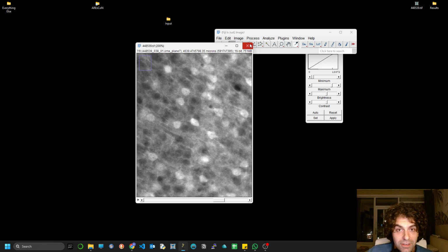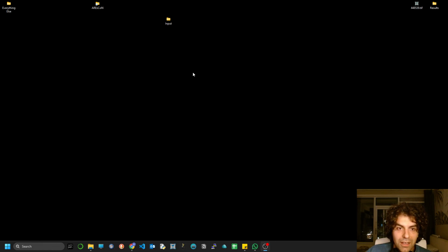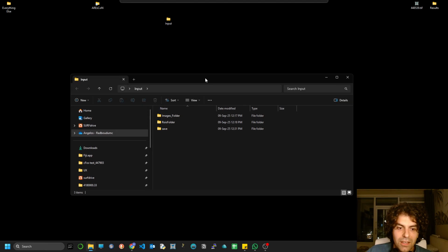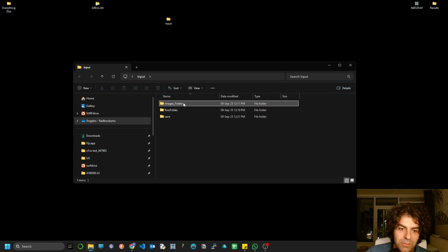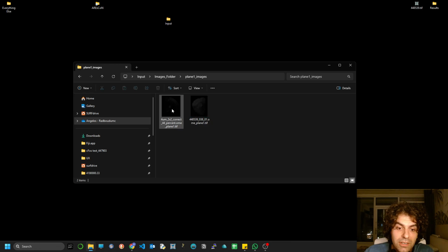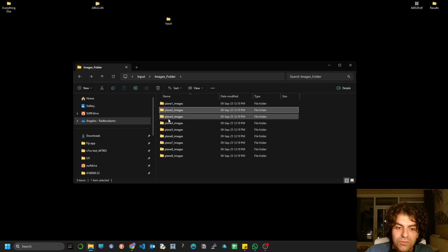And without further ado, because I've made a large introduction already, let's open AResCoN and see how it works. I should show you first what's the input that you want to have, and let's start with the images folder. And here you can see that I've divided this folder into subfolders that correspond to planes. If you have just one brain, of course, that would mean that you should have only one image per folder. In my case, I have two different brains here.